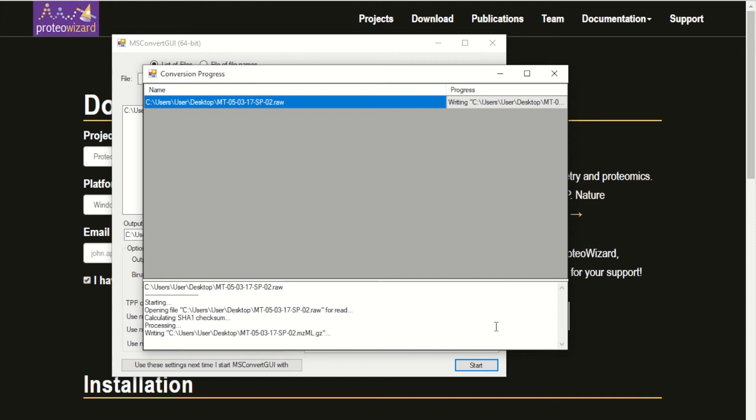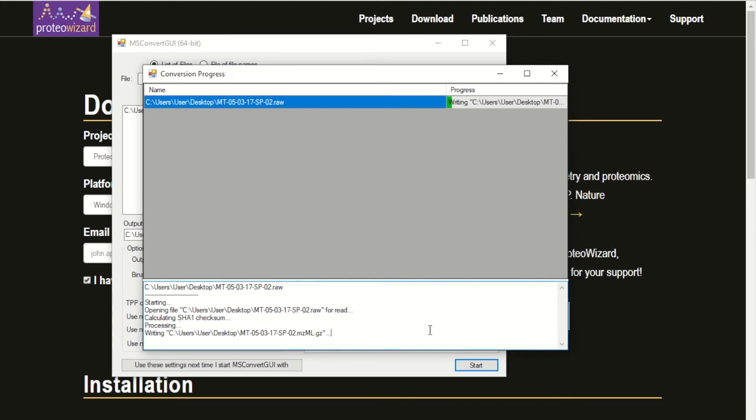It should take less than a minute depending on how fast your computer is. Once it's done, you have the mzml file ready to run any Pythoms script.